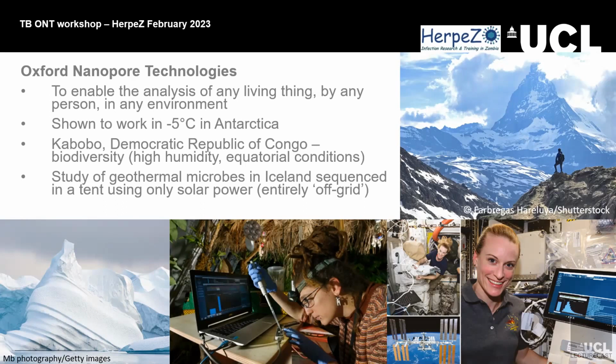Like she was saying, with Illumina you're reading from either end of the strand, and then you're using those overlap sequences to build up your genome. Whereas with Oxford Nanopore, we just amplify the DNA strands that we're looking for, and then those strands are pulled through a pore, as you will see later. The signal that's generated when each nucleotide goes through the pore is the one that's read off. So A will produce a particular electrical signal, and C, T, and G will produce their own specific electrical signals.